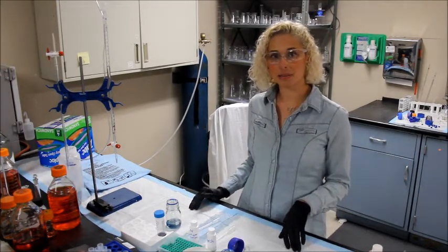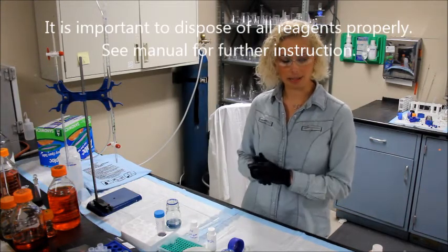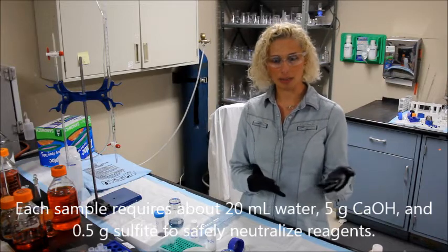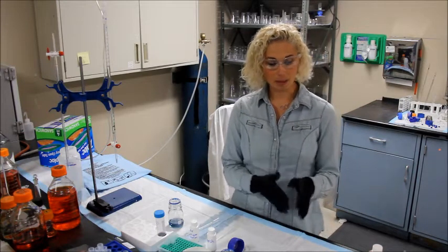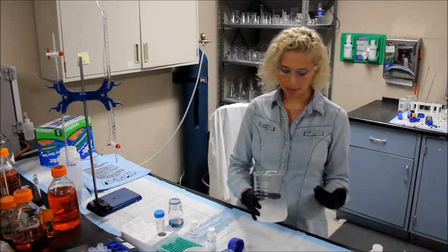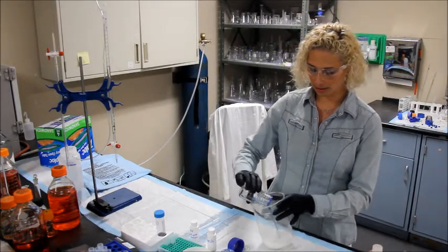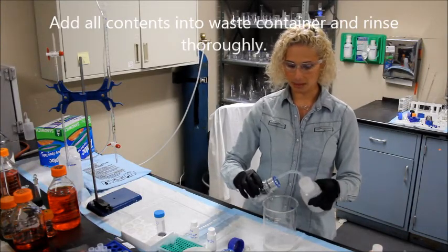Due to the hazards of the materials, it's important to dispose of the completed samples as directed in the manual, and continue to wear your protective gear. For each reaction bottle, you want to place about 20 mls of water, 5 grams of calcium hydroxide supplied in the kit, and about half a gram of sulfite — either sodium sulfite or potassium metabisulfite — into a waste container made of glass or polyethylene. I added about 10 grams of calcium hydroxide and 1 gram of sulfite in about 50 mls of water here, so carefully add the contents to your waste container.